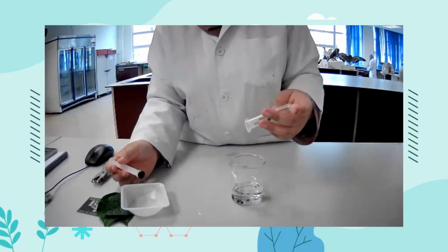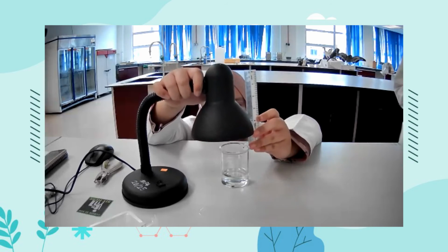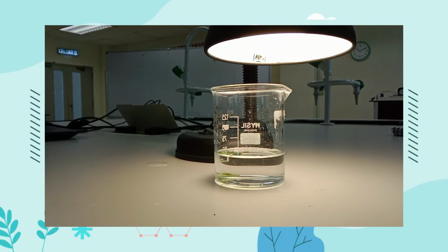Next, we are going to pour the leaf discs into the bicarbonate solution beaker and set up the light 3 cm above the solution, turn the light on and set the timer. Record the number of floating leaf discs until all of them are floating. Remove the light and wrap the beaker with aluminium foil or put it in a dark space. Repeat the steps with the same leaf but with the light 10 cm from the beaker.